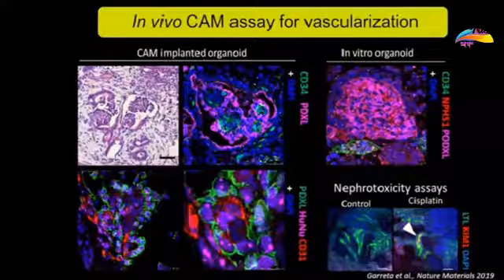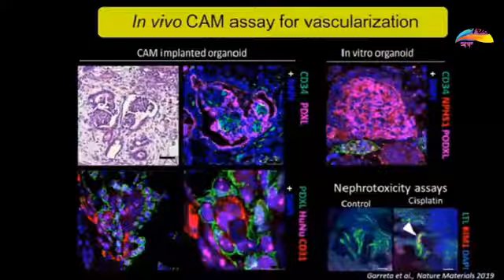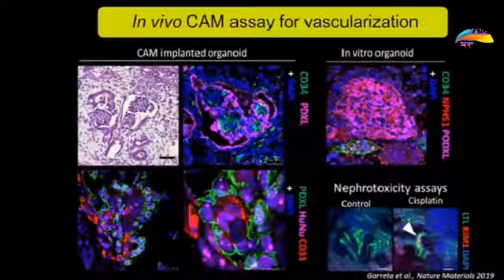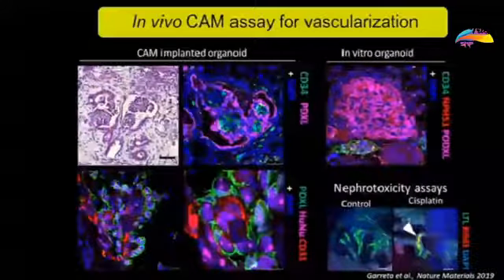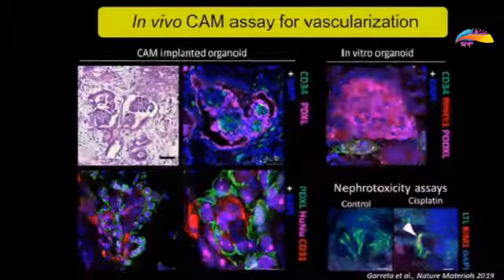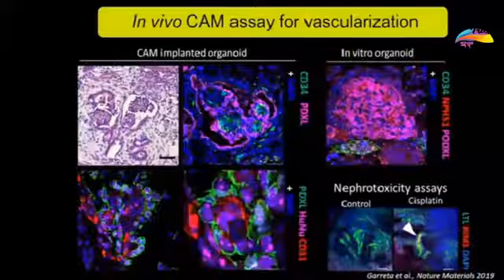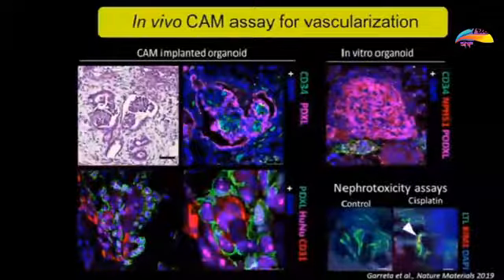And as you can see here, in consecutive sections of experiments, by hematoxylin and eosin, we could observe glomerular-like structures in which, after staining and ulterior confocal analysis, we used a marker for detecting human cells in green, and we detected in close vicinity cells in magenta expressing podocalyxin. Also, we were taking advantage of other markers such as CD31 and nuclear antigen in order to further detect these endothelial cells.